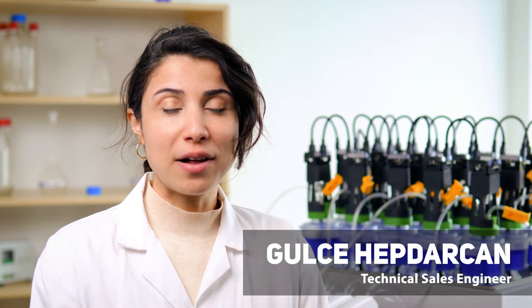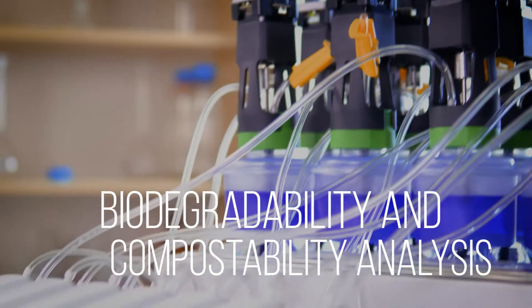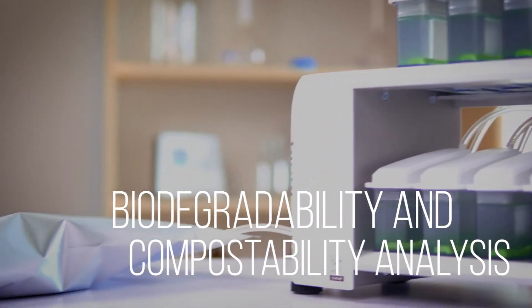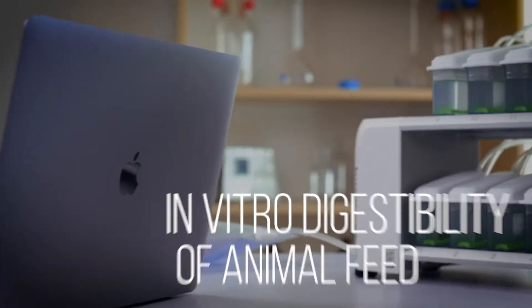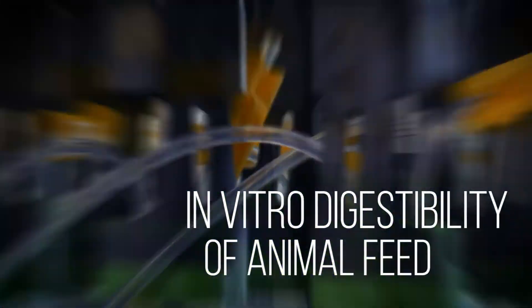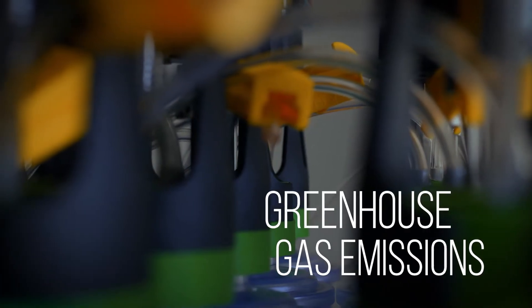Gas Endeavour is a versatile instrument that lets you perform multiple types of different tests. Examples of these are biodegradability and compostability analysis of different materials, in vitro digestibility of animal feed, and greenhouse gas emissions.